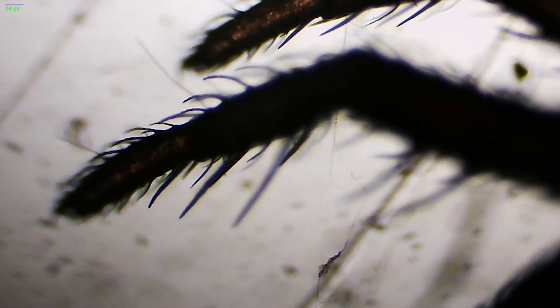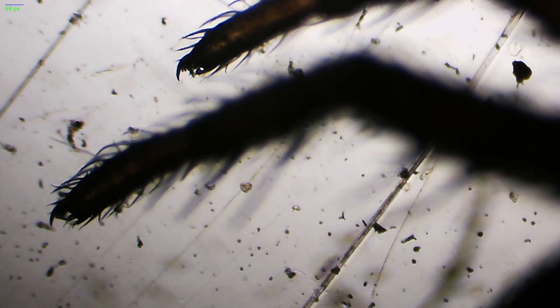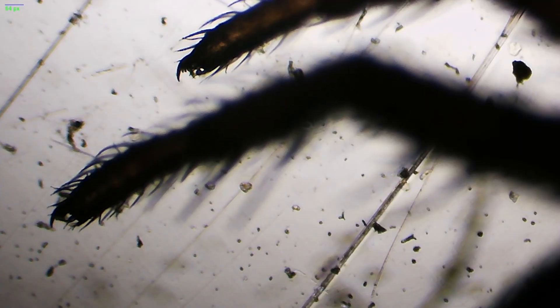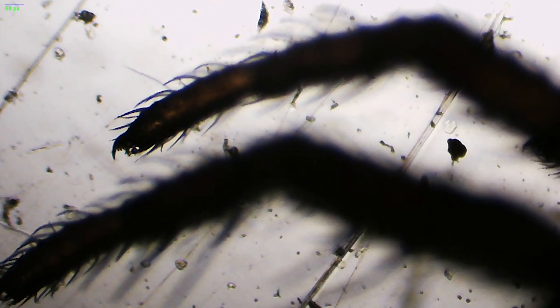Now look at those hooks on the end. Almost all spiders have these hooks, and these guys in particular use these for grabbing onto their prey. Their two front legs are used to grip their prey and just take it down, very much like pincers on crabs.